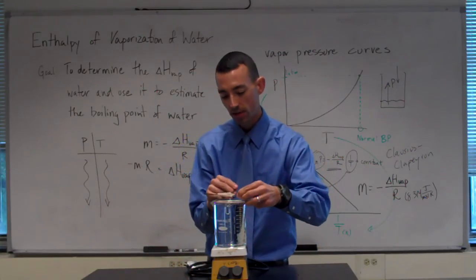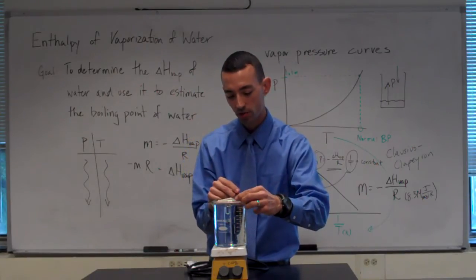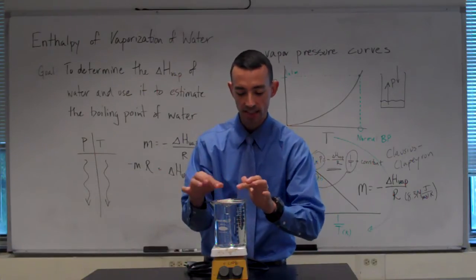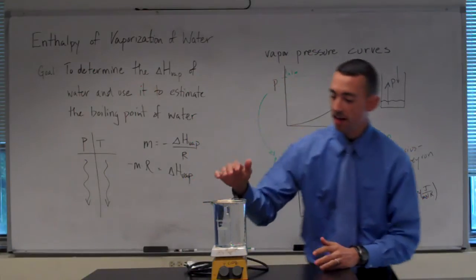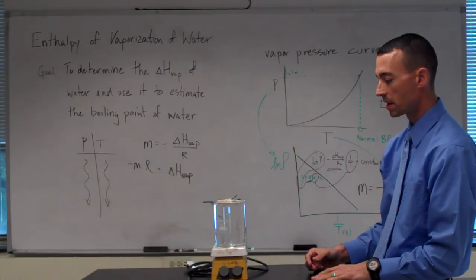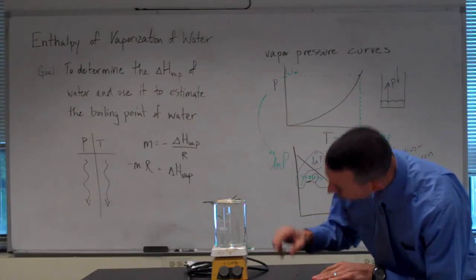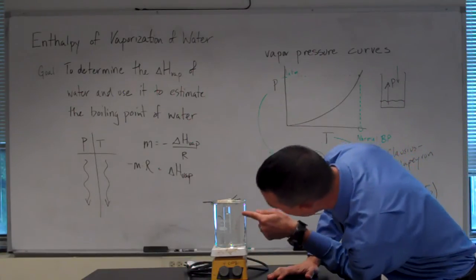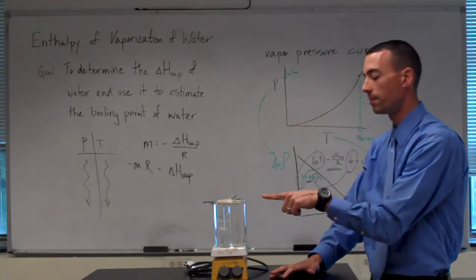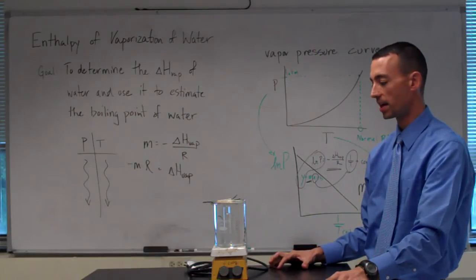I've taken the liberty to make a clay triangle that I've bent a little bit just to rest on top of that cylinder. I've learned from past years that this is not the most stable arrangement you could see, and so just that little bit of weight on the top of it is going to keep it from falling over. Now as we heat this up and cool it down, that bubble of air that's trapped inside the cylinder, whose volume I can now read, although it's upside down, be careful when you read that, will expand and contract with the temperature.